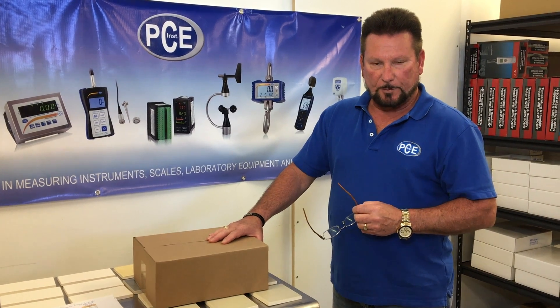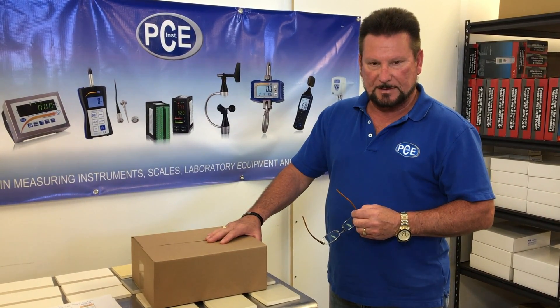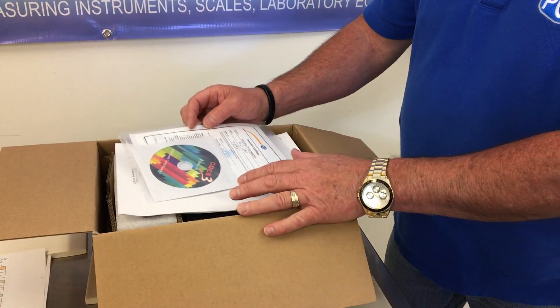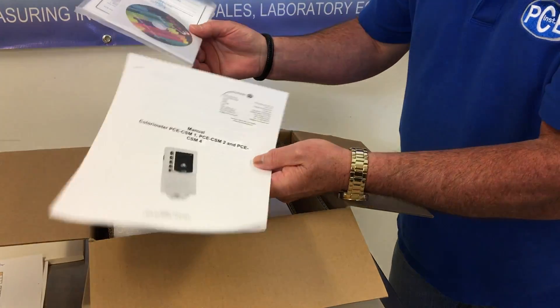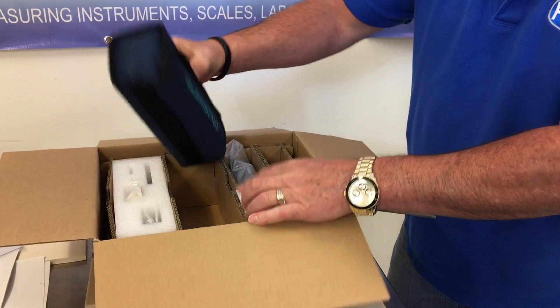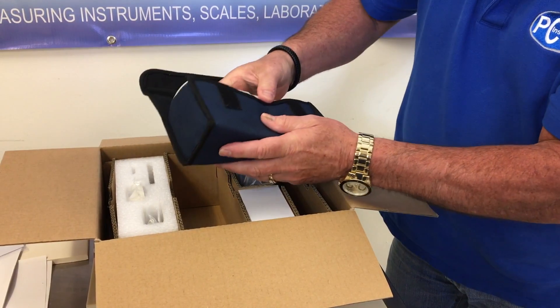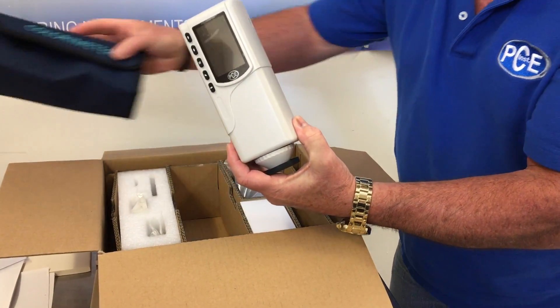Hello, my name is Donald from PCE Americas and today I'm going to be demonstrating the color meter, the PCE CSM1. This is the color meter and this is the way it comes in a box with the software and a user's manual. We have a nice case for the color meter with a handle. This is the PCE CSM1 color meter.